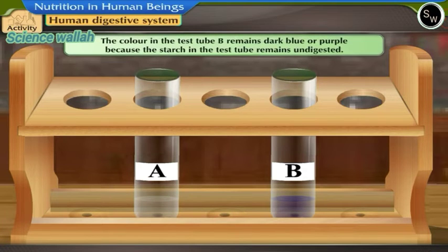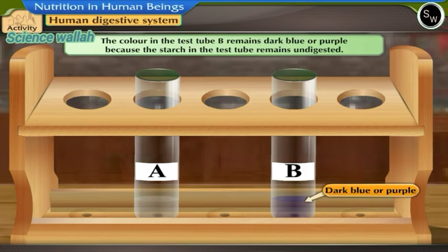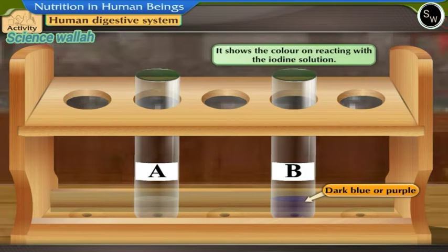The color of the solution in test tube B remains dark blue or purple as it was earlier because the starch in the test tube remains undigested. It shows the color on reacting with the iodine solution.